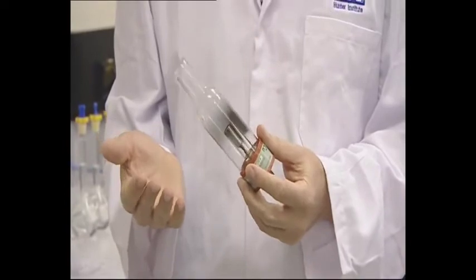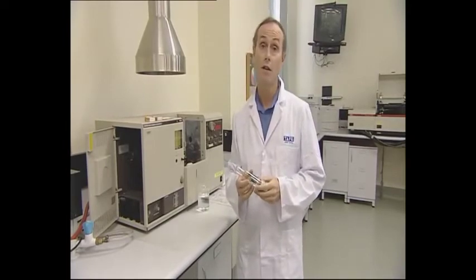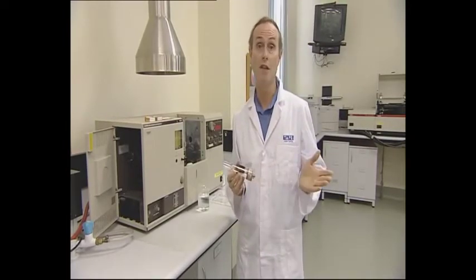It means we have to have many hollow cathode lamps. It also means we can only analyse one element at a time with AAS. These days that's seen as somewhat of a limitation. Some research instruments replace the HCL with lasers. This makes them more sensitive and also allows them to analyse more than one element at a time.